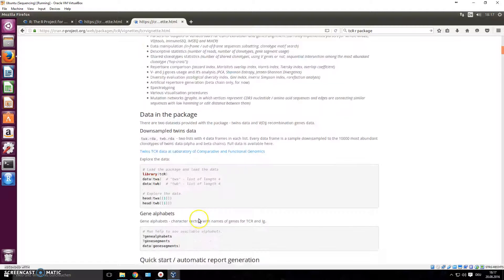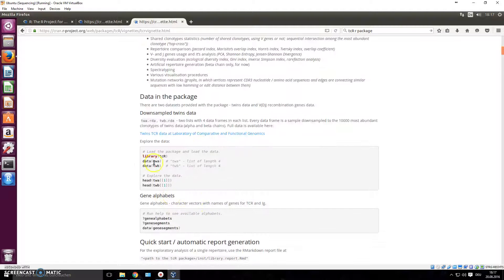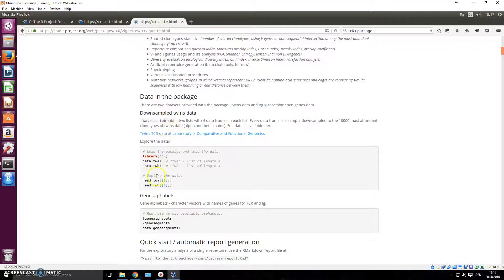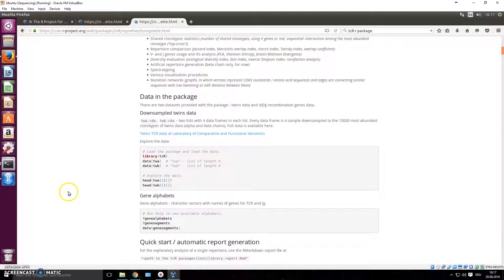There it says how to use it and what the package does, and all of the different commands are listed here. So now we need sequencing data to be analyzed. I have downloaded new sequencing data, so I'll just quickly show you guys.